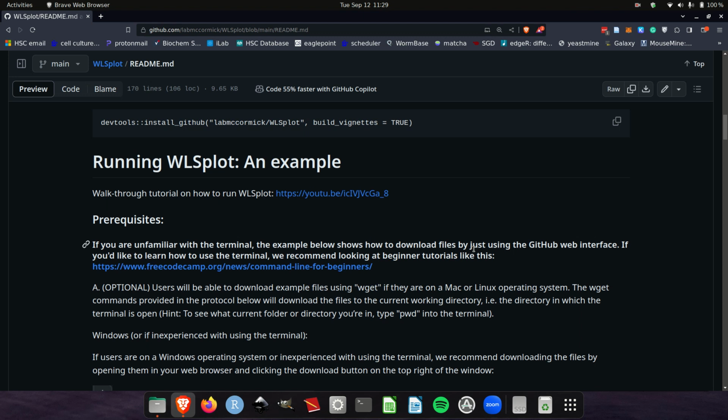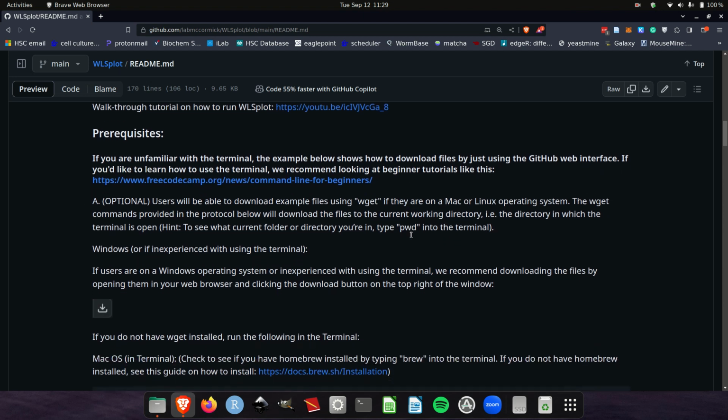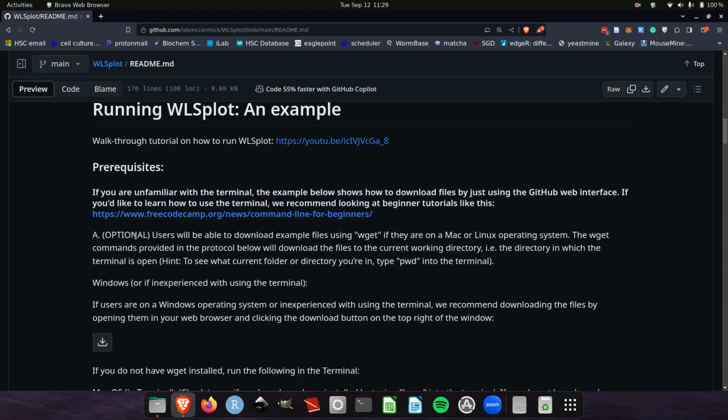Back to running the WLSplot as an example. I will link this and update this link once this video is loaded on to YouTube. So let's start with the prerequisites.